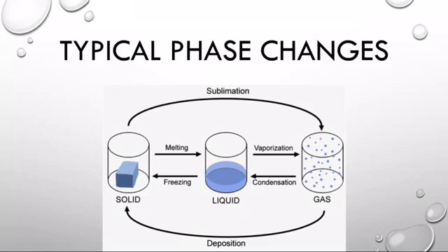Or not. So when ice freezes, the water forms small crystals that gradually spread. If you catch the cold water before the crystals have time to form, you can still pour out the water and it will freeze as you pour. Pouring it over an ice cube triggers crystals to form faster than they normally would. However, as you can see, it didn't quite form or work.